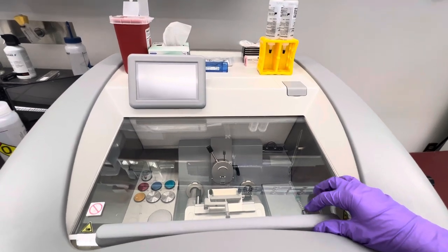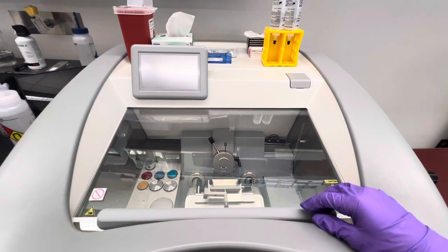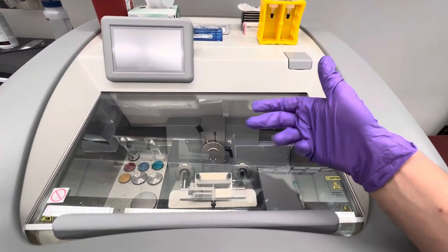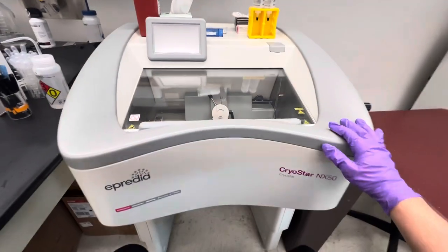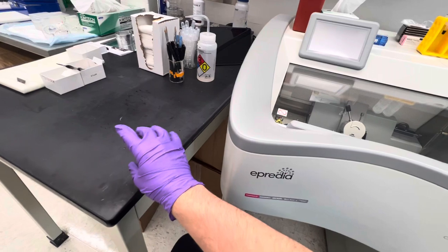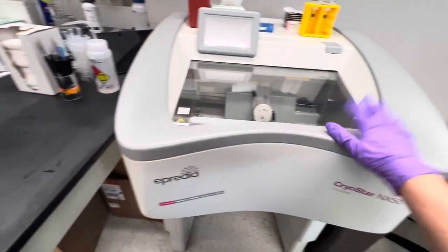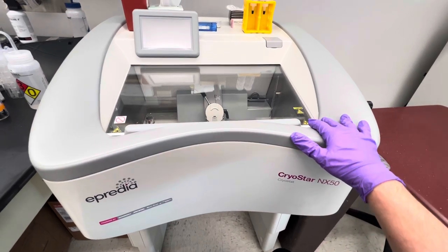And this is for anybody who, hopefully, would have read through the actual protocol, but this is to help you out by showing you things without pictures so you can see it hands-on, so to speak. So, you're learning about cutting. Today I won't be showing you the setup in terms of any of the plates or anything, but I might get that into another video. However, for right now, we're just going to go over the parts of the cryostat and working with it.